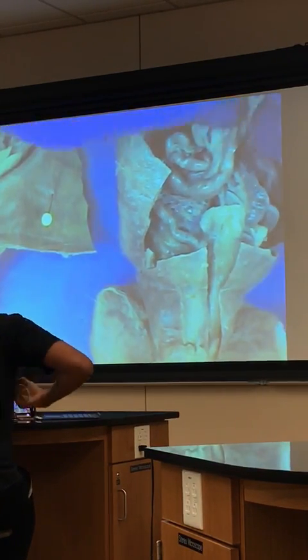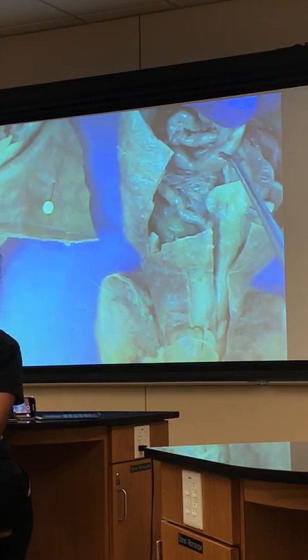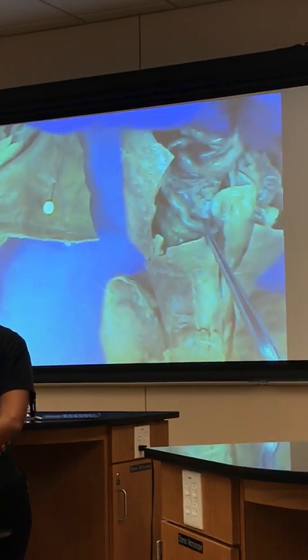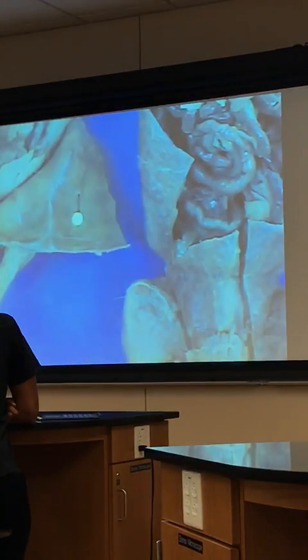And what made me remember, see the structure right here? That's poop. That's a rat dropping right here. So here's another rat dropping right there. And that's going to come all the way out through the back end.